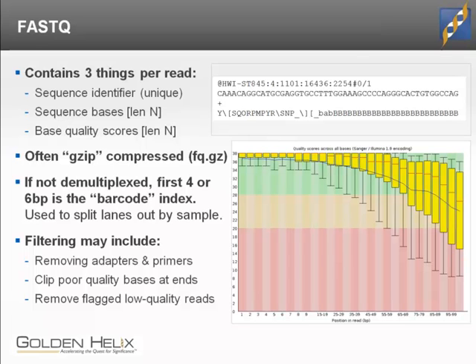When you get your short read data, particularly if you're using an Illumina platform, you get this FASTQ format. You get it from other platforms too. One thing to be aware of, for example, if you have 100 base pair read lengths, the last several bases of a read, the quality always drops off. That's why with BWA, for example, it clips reads at the end of the read if the quality score starts to drop off.